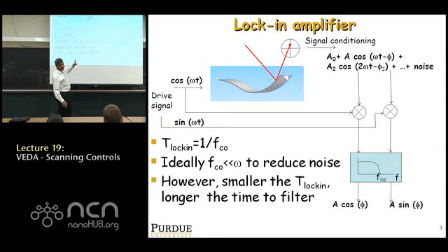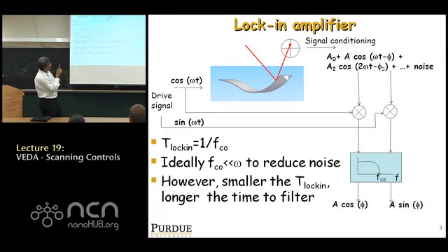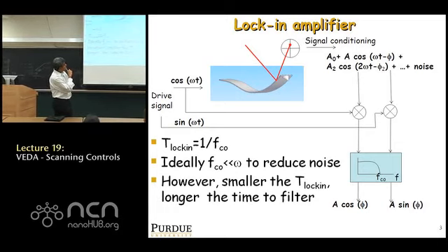So let's go over this again. I've got that term on top, the output of the photodiode. I'm multiplying it by cosine omega t, and we're asking: you have many product terms, right? Cosine omega t with the first, second, third term, and they occur at different frequencies. The only term that occurs at DC in the product signal is the one involving cosine omega t.